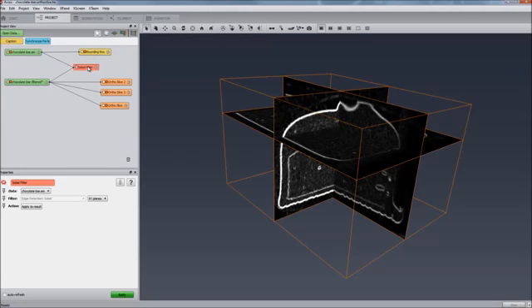This ends this tutorial about the basics of modules manipulations. Please try it yourself.